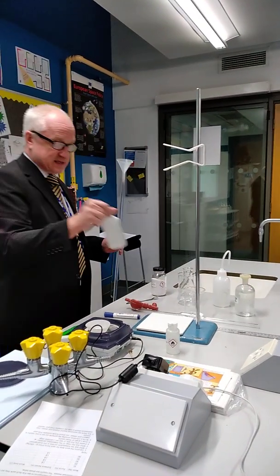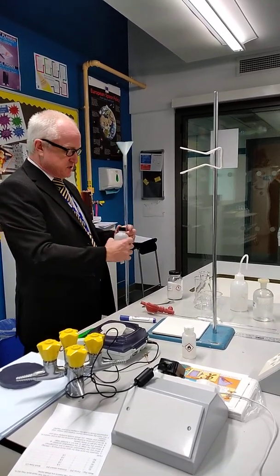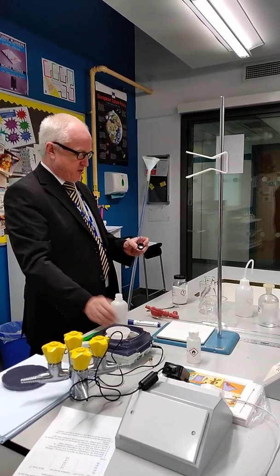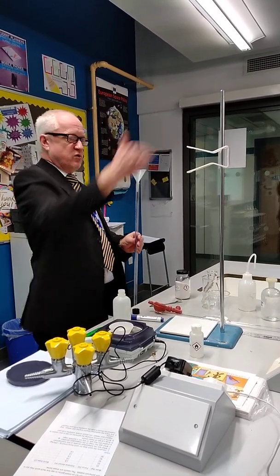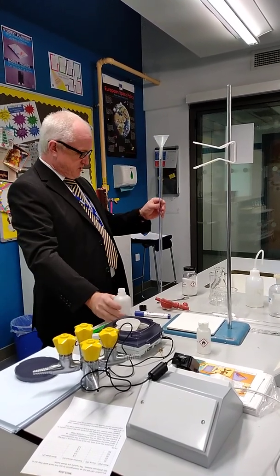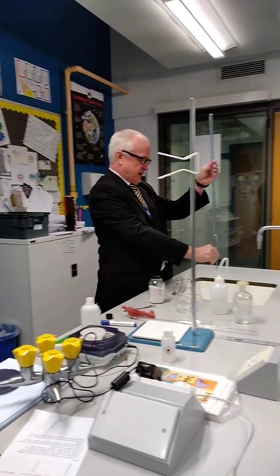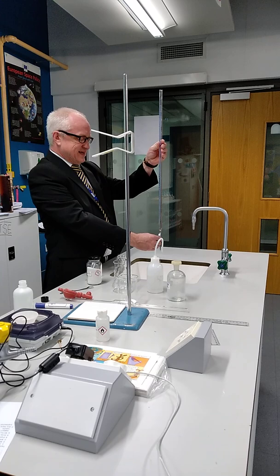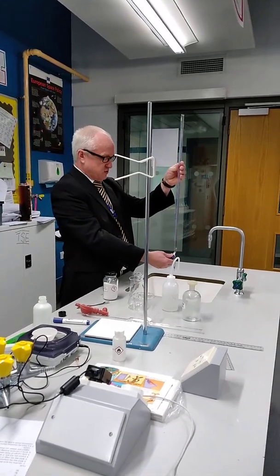I've got my sulfuric acid here, and this is 0.1 moles per decimetre cubed. I'm going to start off by rinsing my burette — I've already checked to ensure it is tightened and closed at the bottom. I'm just going to pour a little bit in and rinse down the sides, then empty that out. The reason I rinsed my burette is just in case it previously had sodium hydroxide in it — I've just neutralised all the sodium hydroxide.